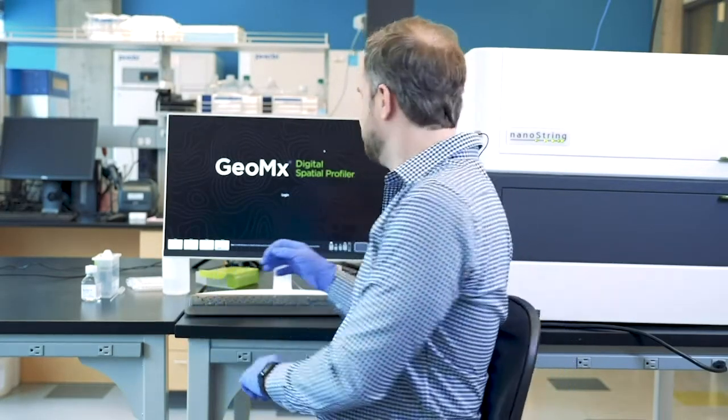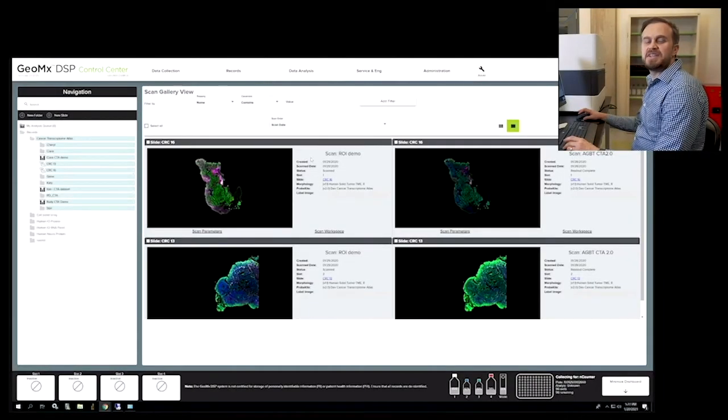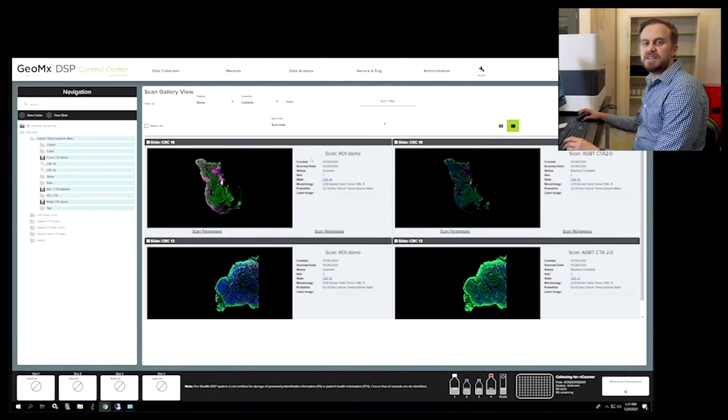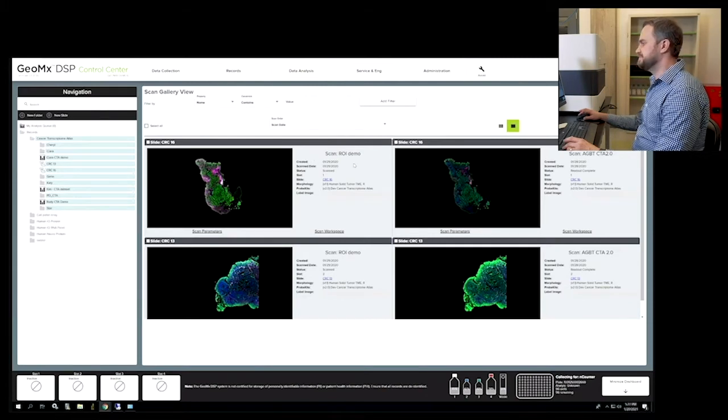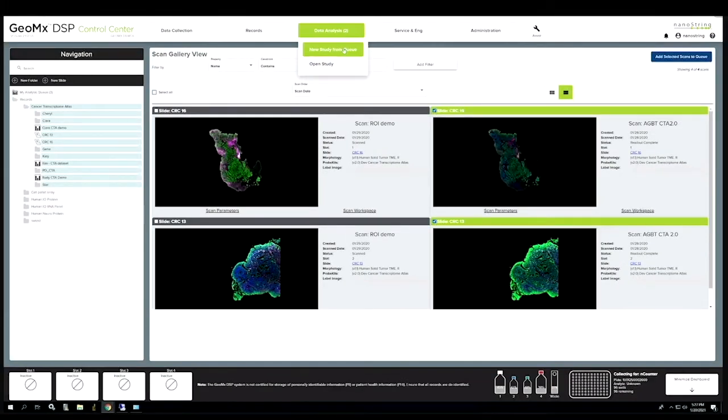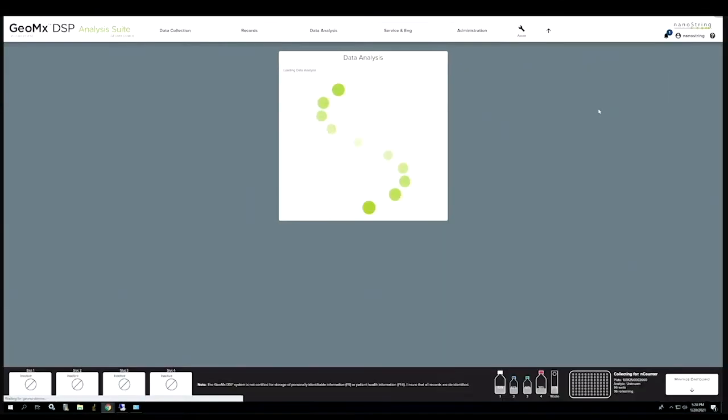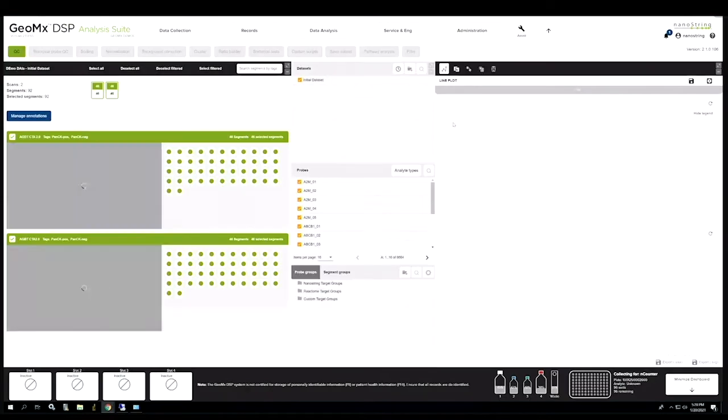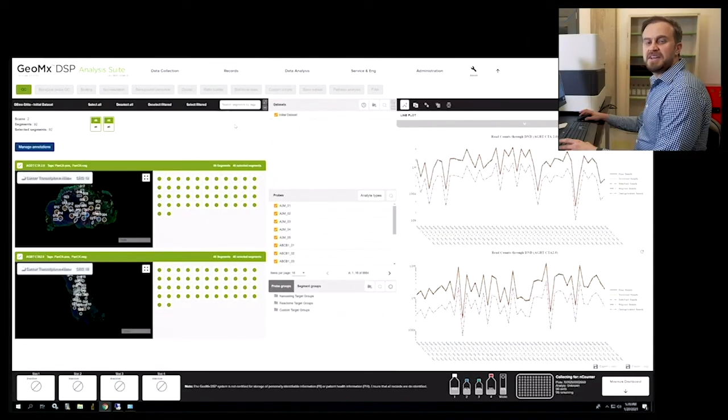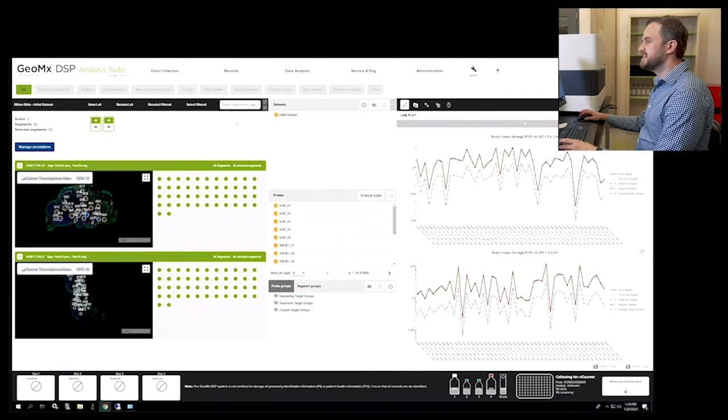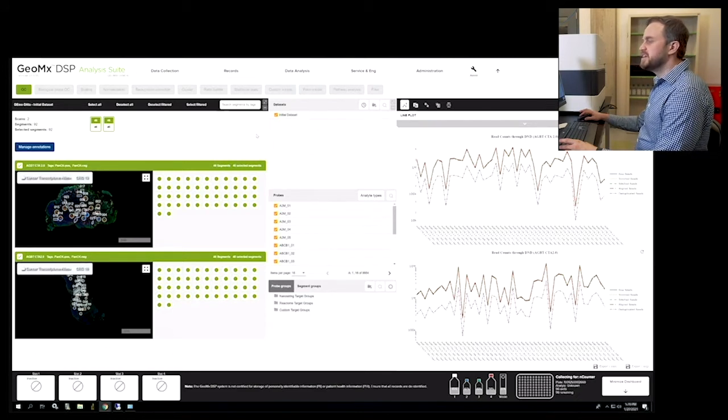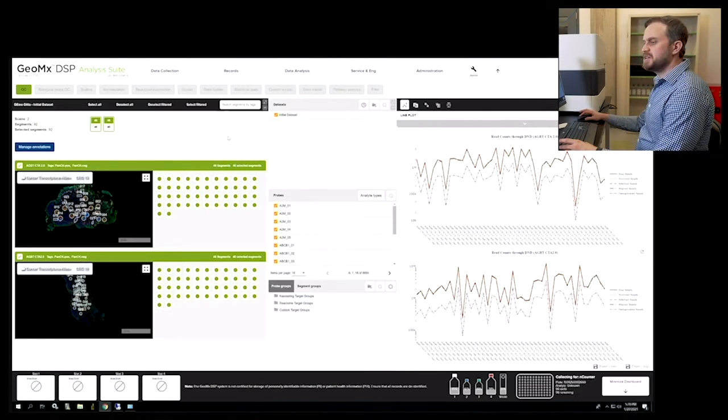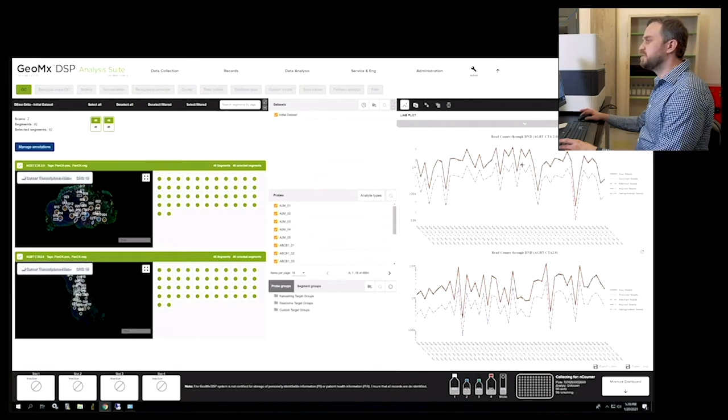Let's do a high-level orientation of Geomix DSP analysis suite now. First we will initiate a data analysis study by adding all the scans we wanted to our study. The data analysis screen is divided into three panes and a taskbar. Here we describe the functions of each pane and the interactions between all three.